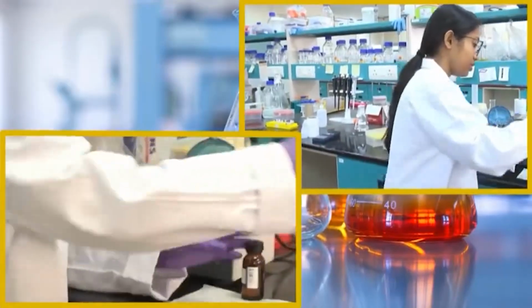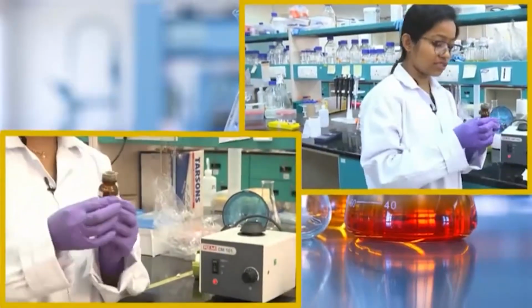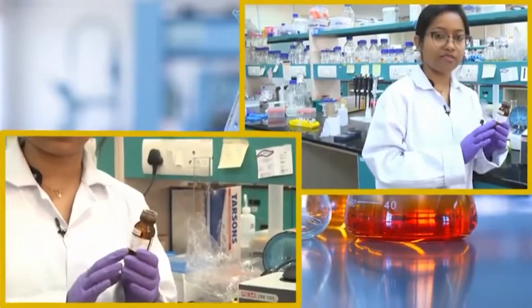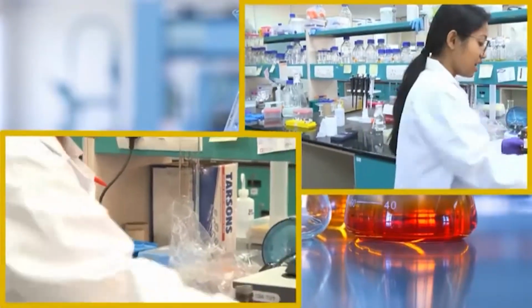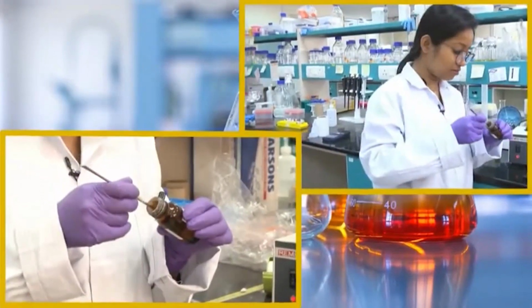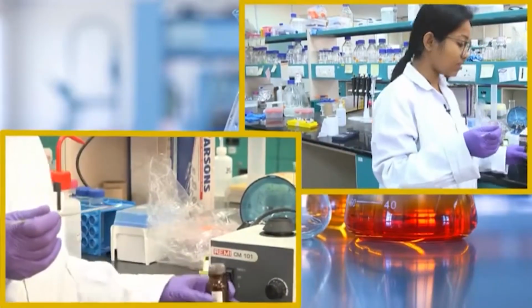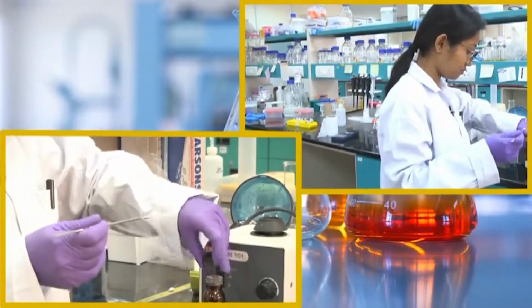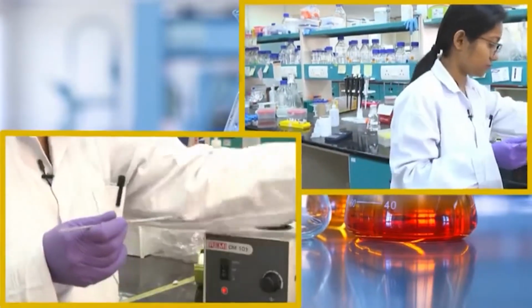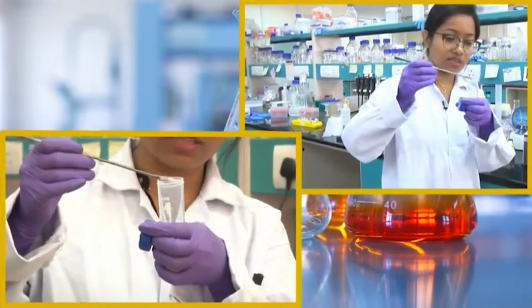You can make a 10 mg per ml stock lysozyme solution. Lysozyme can be purchased from a company as a lyophilized crystalline powder, or you can use the way we are using. Basically a pinch of lysozyme is enough to hydrolyze all the bacterial cellular membrane. So, I am taking a pinch of lysozyme, and then I will add that lysozyme to my solution.